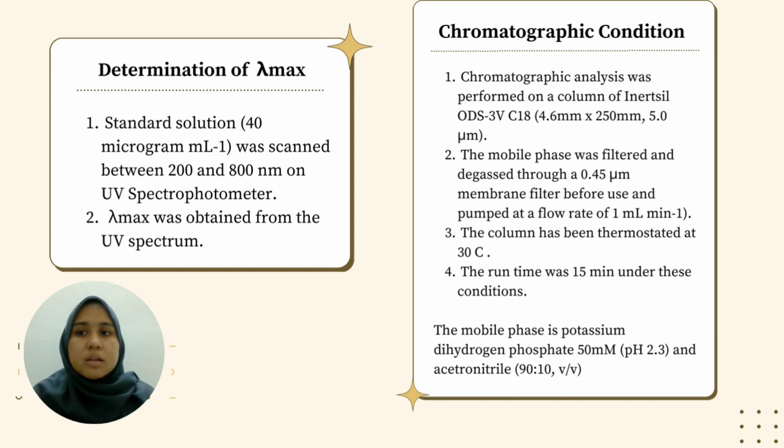Determination of lambda max. To obtain lambda max from the UV spectrum, standard solution 40 microgram per ml was scanned between 200 and 800 nanometer on a spectrophotometer.